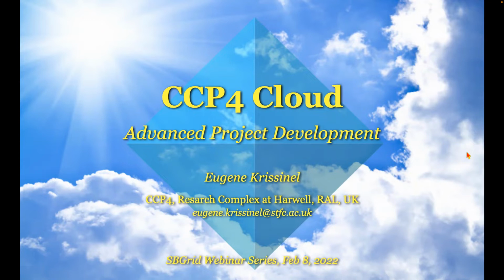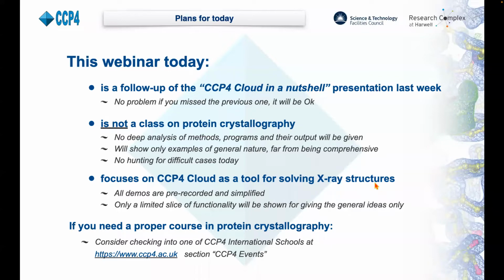Thank you very much, and good afternoon, everybody, and many thanks for coming to the second part of this presentation of CCP4 Cloud, which is the next generation front end for the CCP4 software suite. Today, I'm going to give more insight into CCP4 Cloud capabilities beyond automatic structure solution, which was presented last week. And please, no problem if you missed the previous webinar, which was CCP4 Cloud in a nutshell. All concepts today should be clear for you. The system is designed for intuitive perception. If it is not, then we are a complete failure anyway.